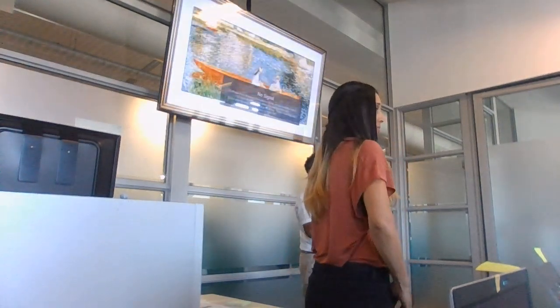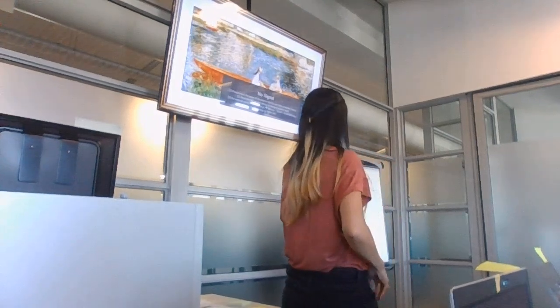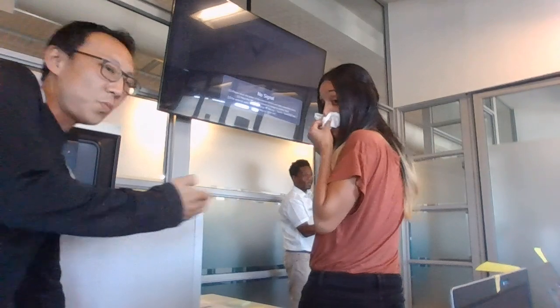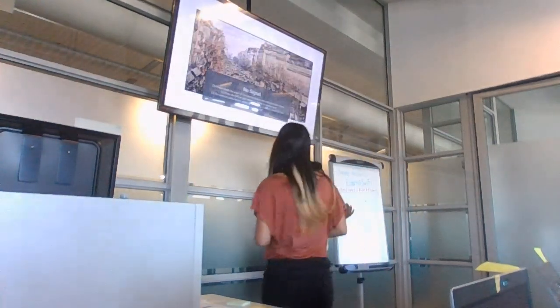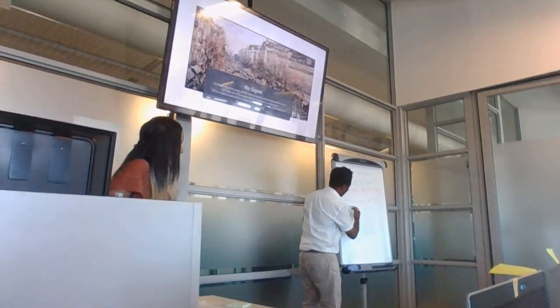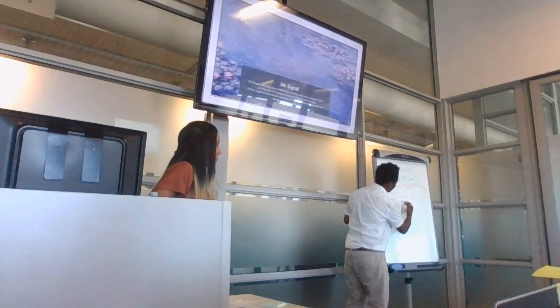So let's go back to the basics. Let's look at what happens when you do sequencing. This is my genome of interest. What tends to happen is that we fragment it. We chop it into pieces, sometimes overlapping.